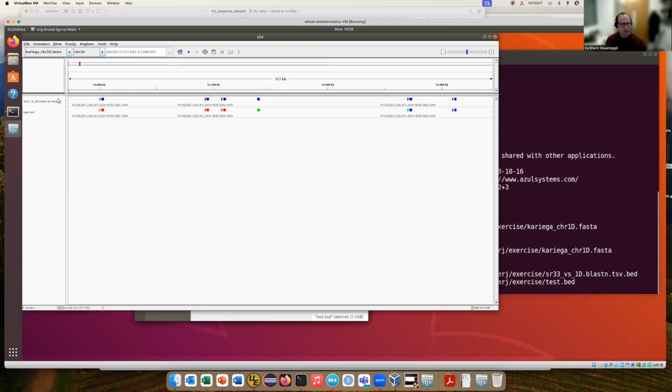Don't worry too much, just make a copy of it. And if you make any mistakes, the worst thing that happens is that your new file will not be displayed. And then you need to mess around a bit until you are able to get something out of that.